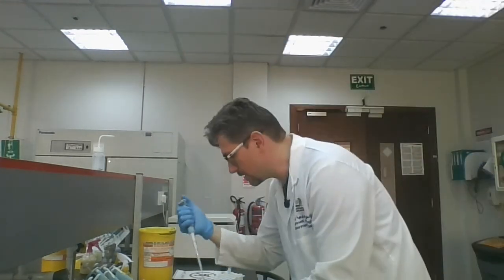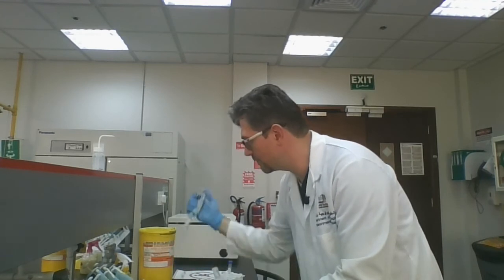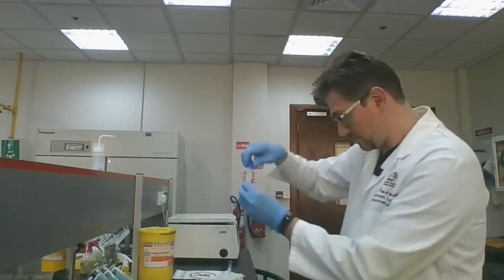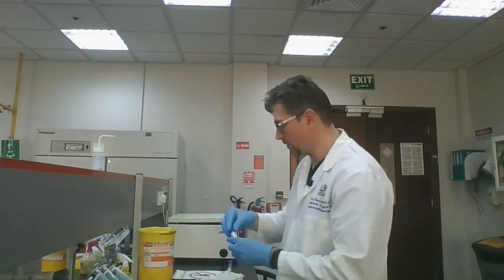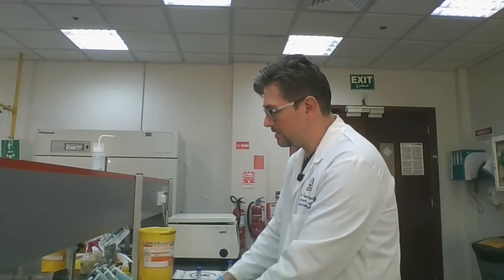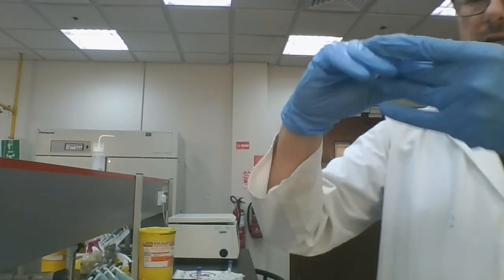And again, that's going to go into my epitube. The waste tip goes into the appropriate container. This gets put away as well. Okay, again, phenol is nasty stuff, so please be very, very careful with it. I'm going to seal these tube tops very tightly, so I'm going to make sure that they are tightly capped.